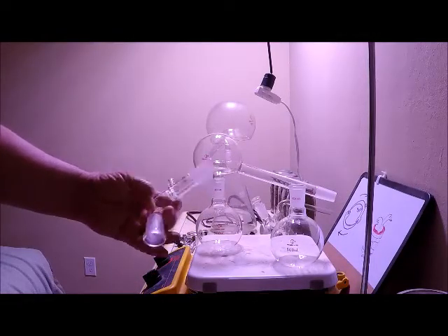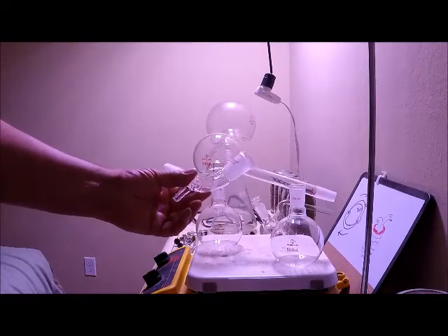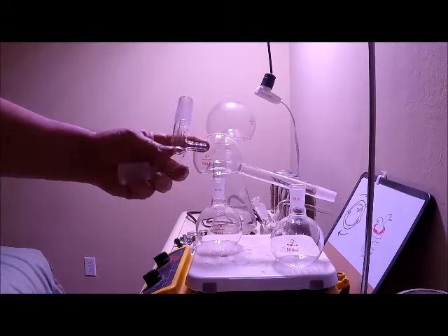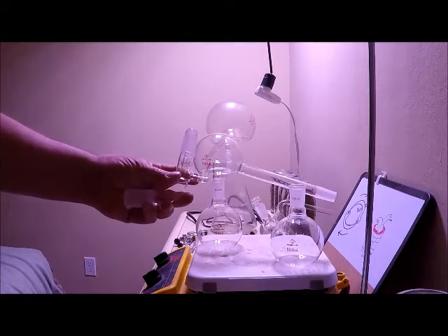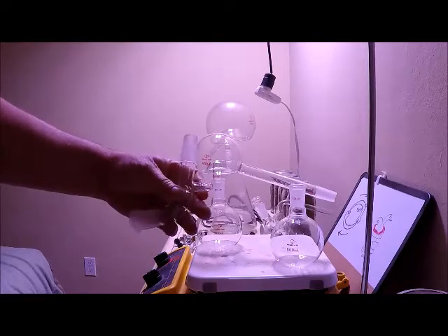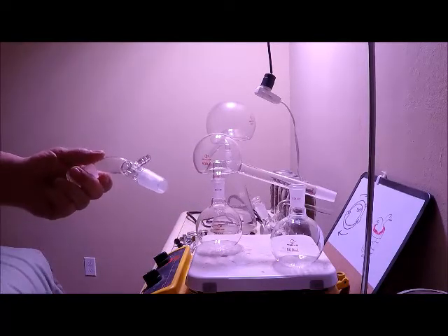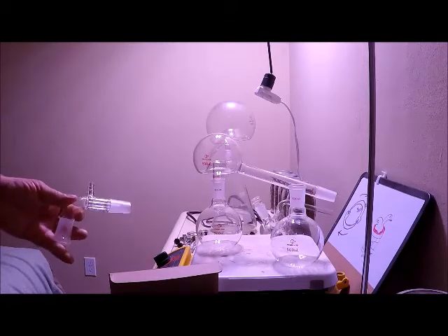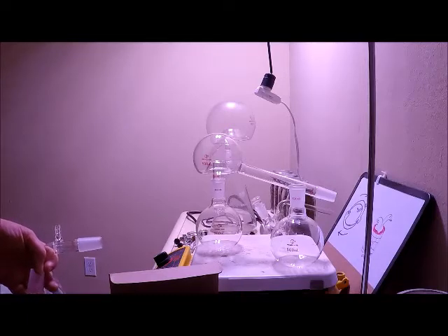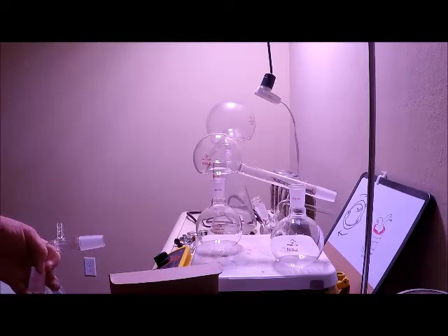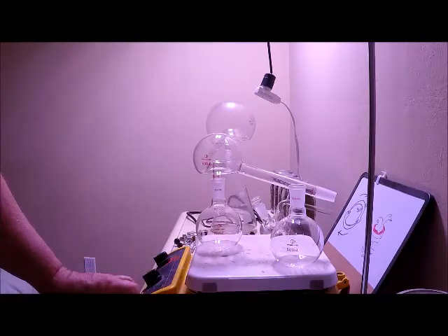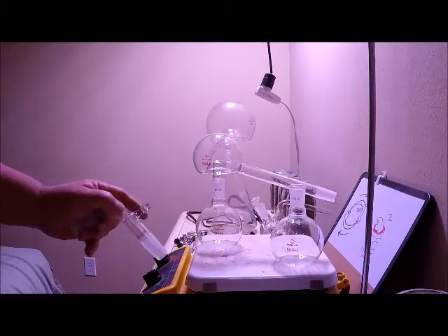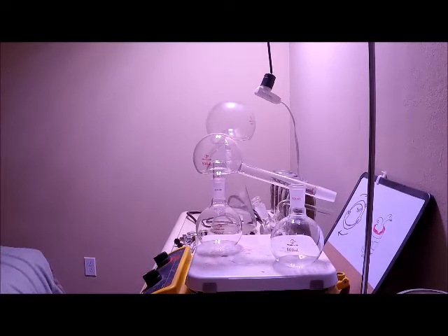And this piece is a vent adapter. 24/40 ground joints. And it has this so you can add a vacuum if I want. If not, I could leave this open or even cap it off. But I'm going to leave it open because when you read old alchemical manuscripts, you might notice a lot of them say the glass has to be sealed, it has to be sealed. You put a liquid in the glass, you have to seal it and then perfectly sealed and then add heat, right? And if you've ever done experiments, you might realize that that builds pressure, it causes the glasses to burst. So I like a little vent, one way or another. A little vent.